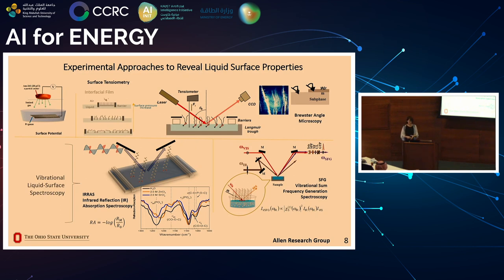So over the last 15 years, I'd say we've been doing quite a lot of infrared reflection spectroscopy, and this is usually with our films. And then on the bottom right, you see sum frequency generation. This is a nonlinear optical tool, so it's a second order response.